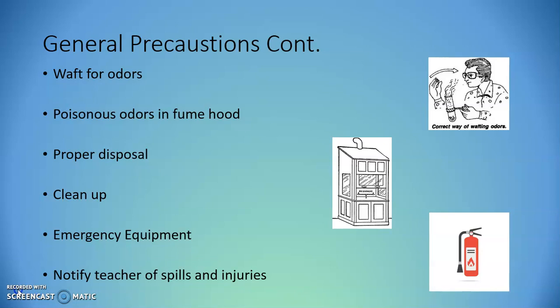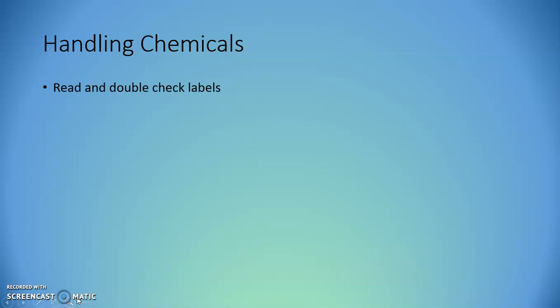Next, we're going to take a look at proper handling of chemicals. First of all, make sure that when you're using a chemical, it is the chemical that you want to be using. Read and double-check the labels, especially if in your procedure it has the name of a chemical and then on the bottle it has a formula. Make sure that it is what you are actually supposed to be using.